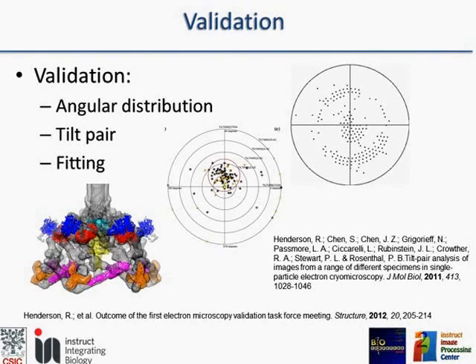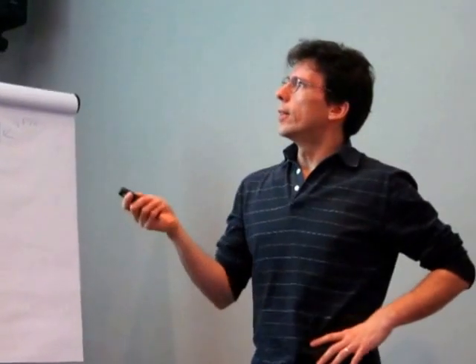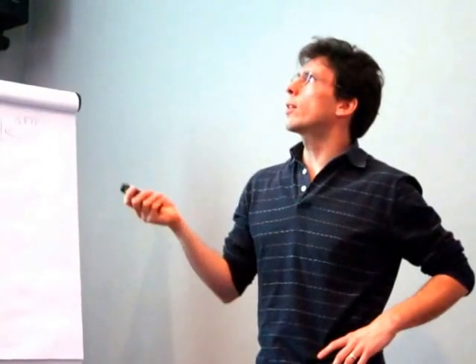Okay, so you have taken all your care, and still, at the end, you have to validate that what you have obtained is the correct structure. And the three most popular techniques are these ones. So first, you have to see what is your angular distribution.